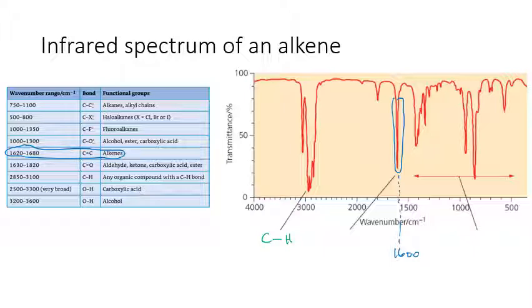The thing to be careful with on this one is not to assume that it's a carbonyl group. So the carbonyl group is slightly less fine of a peak, and it's shifted over to the left there compared to this carbon double bond peak. All right, so this peak here that we've just drawn here is our carbon double bond carbon, and identifies it as an alkene. And again, we tend to sort of ignore this fingerprint region.